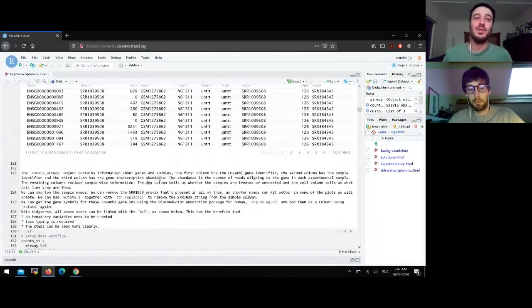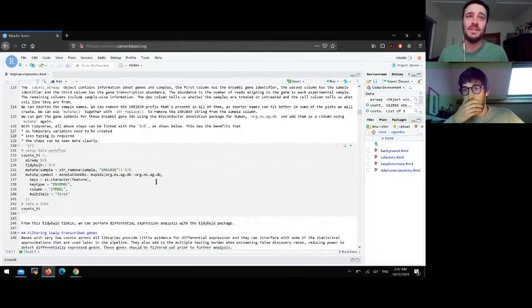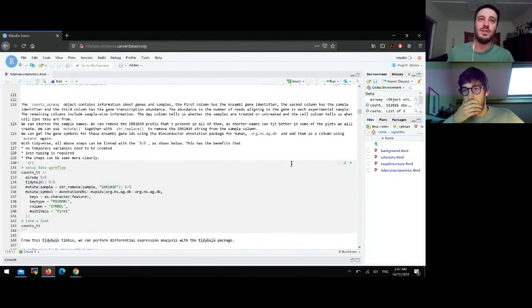And as you will see, it uses a quite clear self-explanatory grammar, so no acronyms and no specific jargon, okay? Because the goal is really to make it easy for even users that are starting to understand better what analysis they are doing.